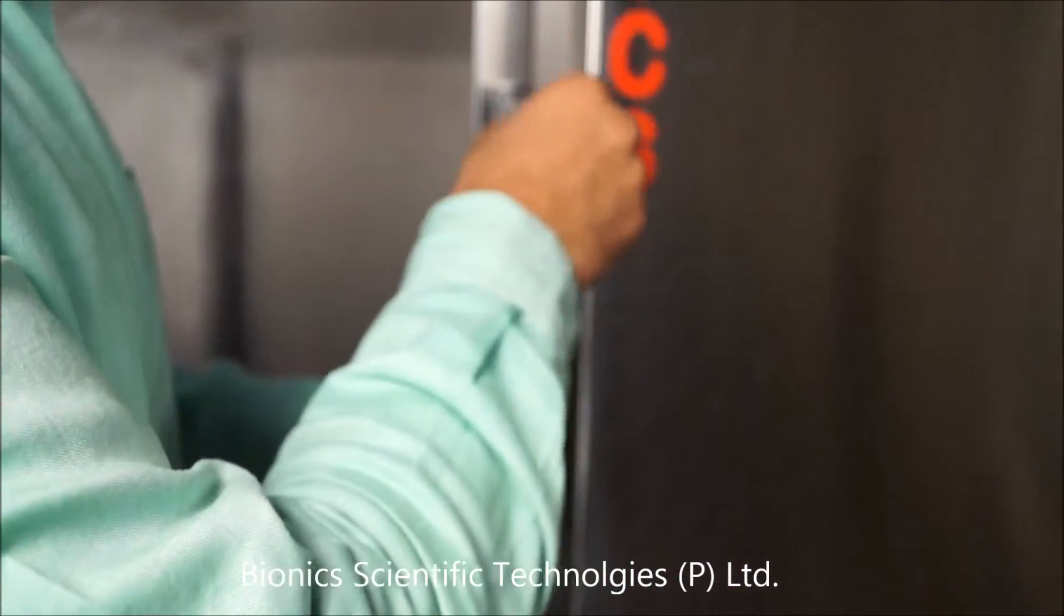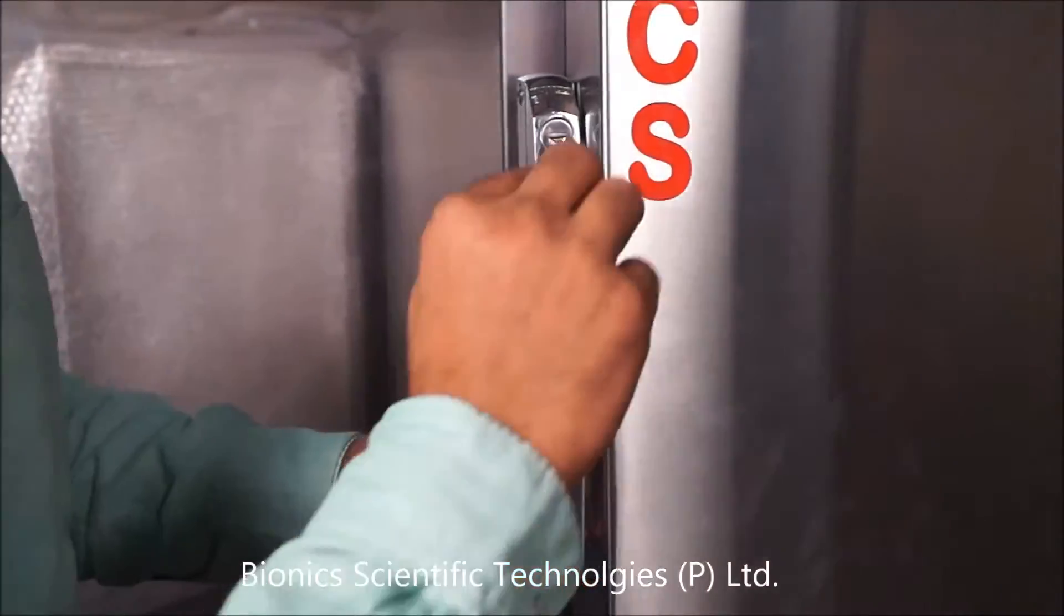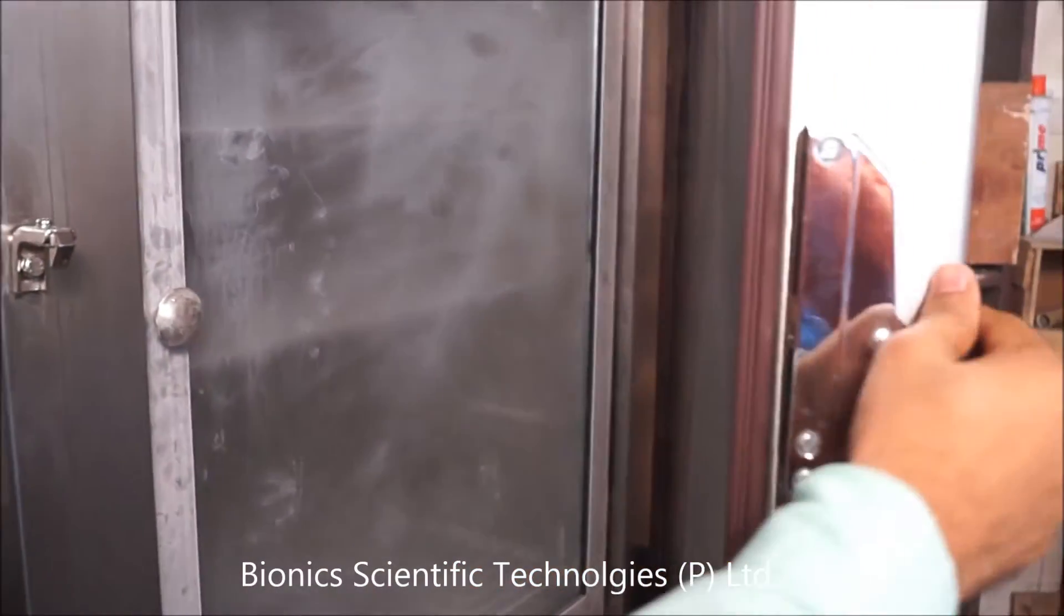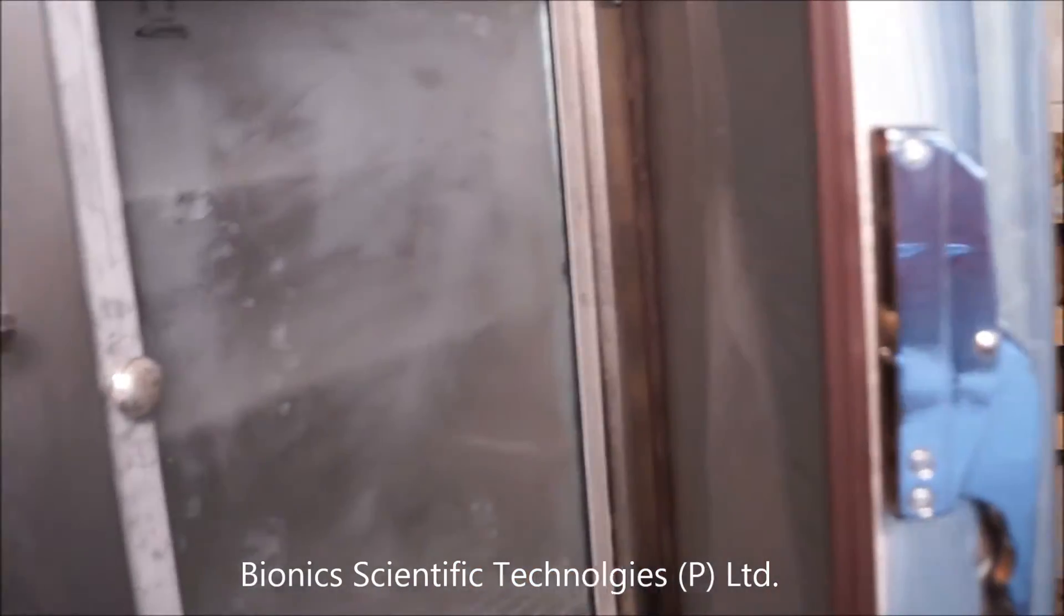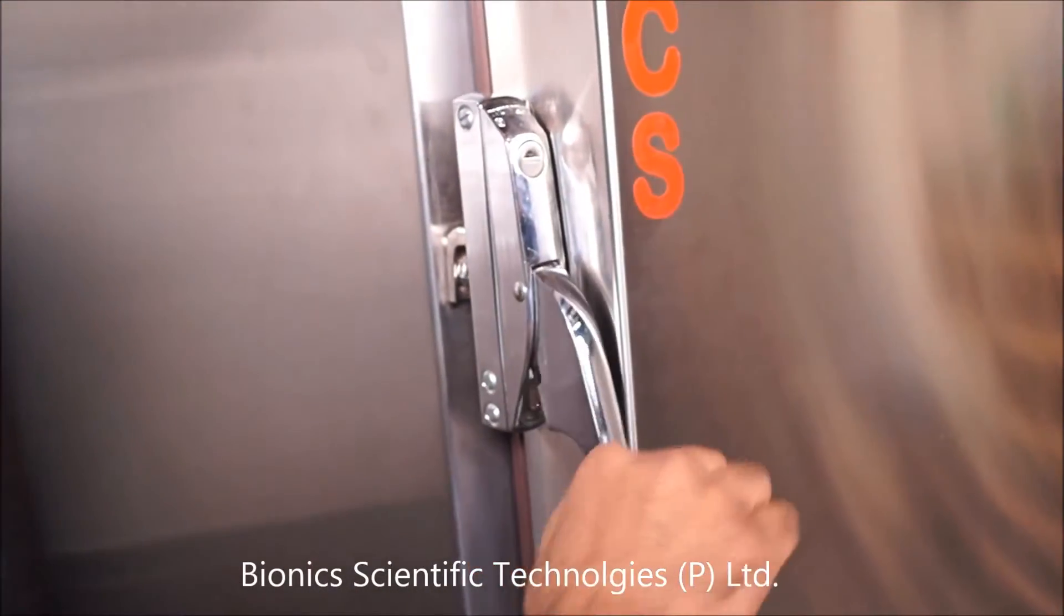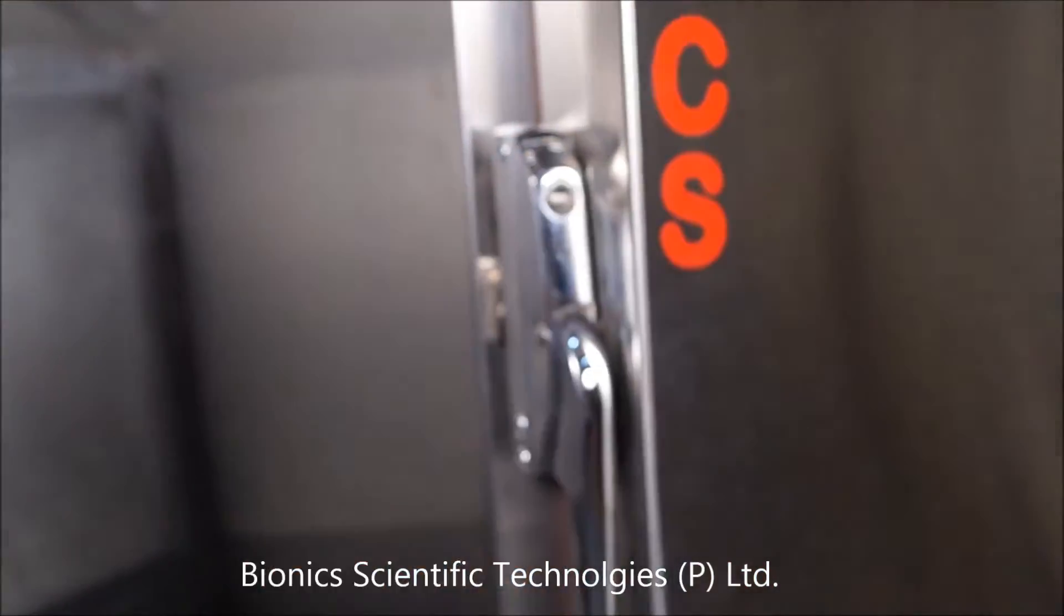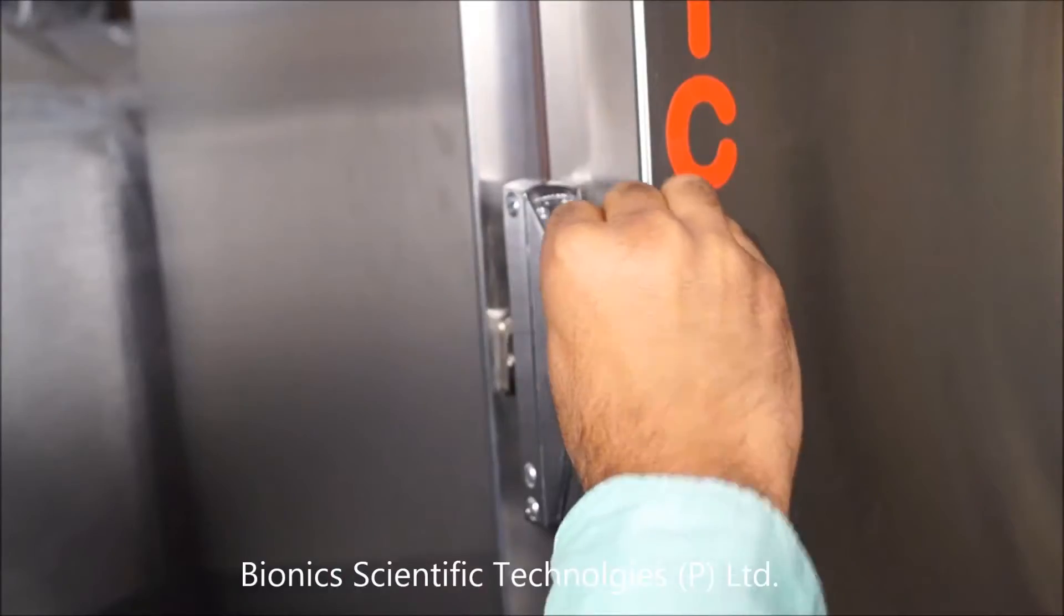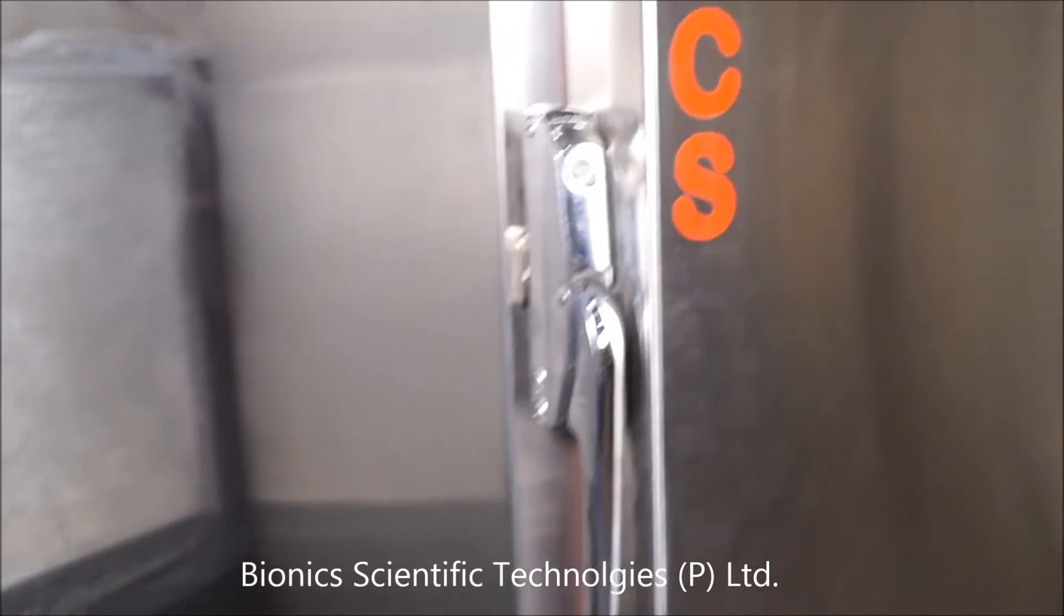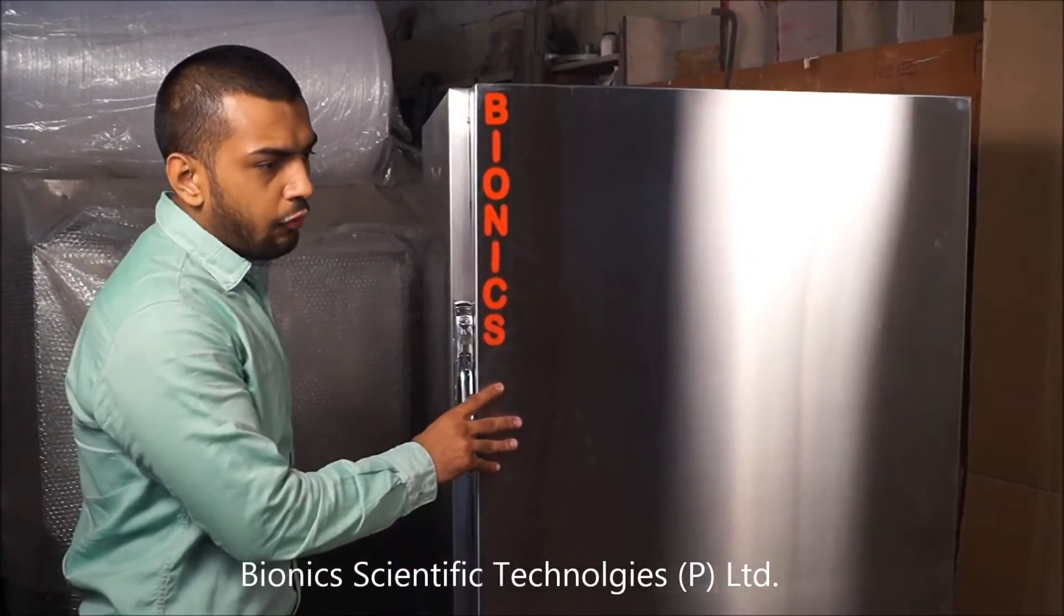This is a door latch. You can lock and unlock like this. This is locked now. You can unlock it like this. This is how we open it.